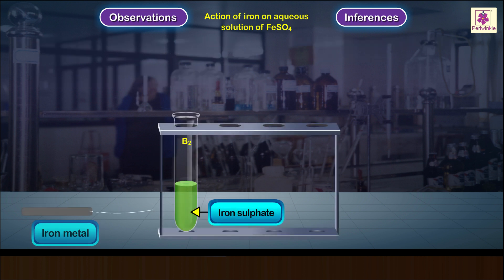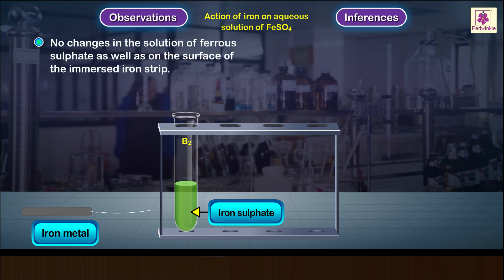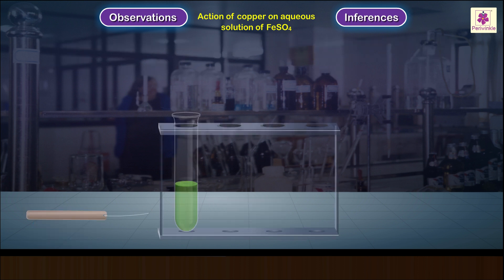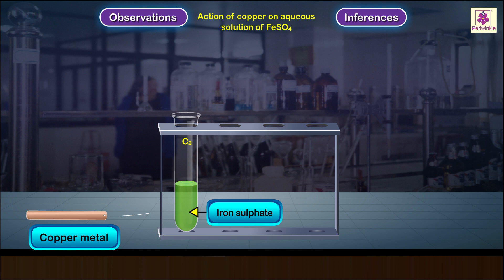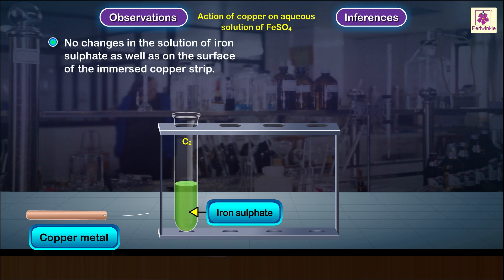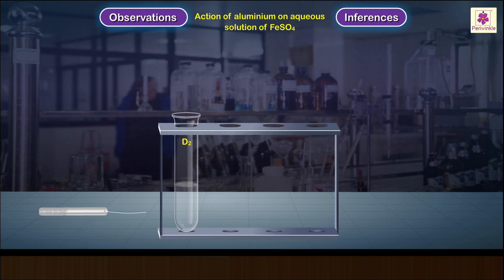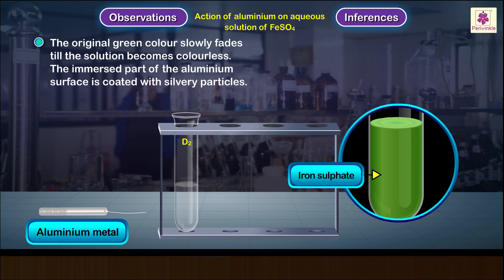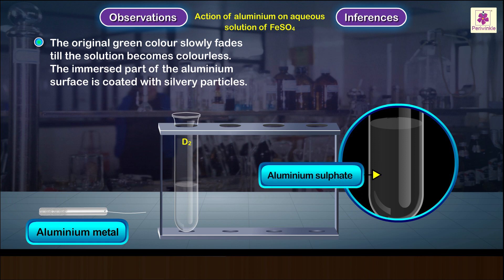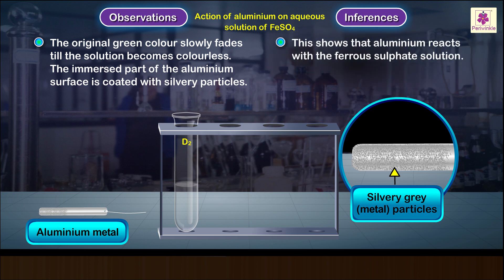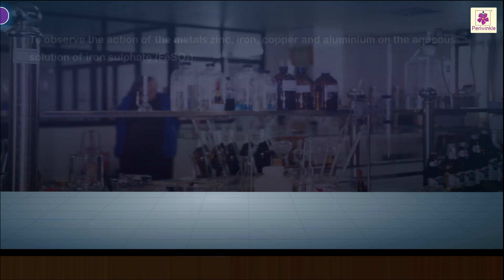Test tube B2 containing iron metal: no changes in the solution of ferrous sulfate, and no changes on the surface of the immersed iron strip. This shows that there is no reaction between iron metal and the iron sulfate solution. Test tube D2 containing aluminum metal: the original green color slowly fades until the solution becomes colorless. The immersed part of the aluminum surface is coated with silvery particles. This shows that aluminum reacts with the ferrous sulfate solution. Conclusions A2 noted.